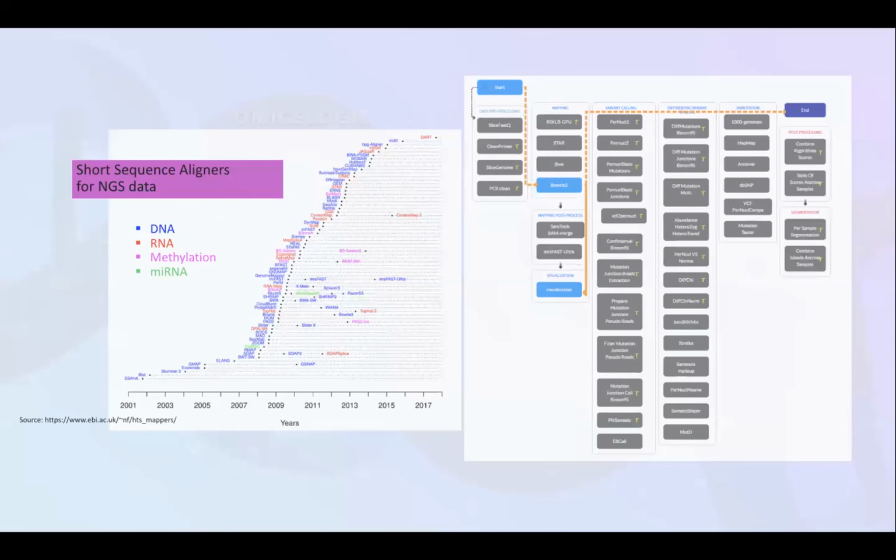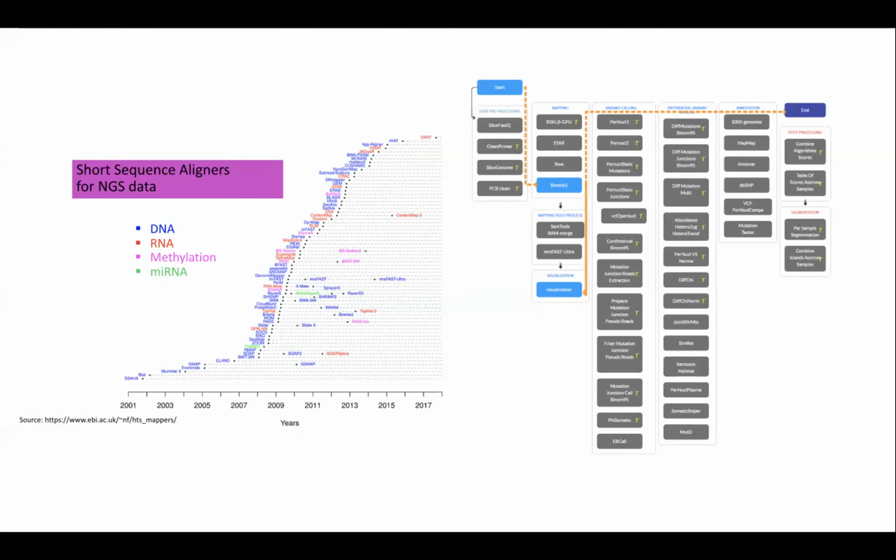So, for example, some of the things that we think are important here is the ability to really understand the various next-generation sequencing techniques that allow us to study a variety of biological, molecular biology phenomena. Like, for example, we can look at variants in DNA, we can look at expression of RNA, we can look at DNA methylation, we can look at microRNA signaling, and other aspects of what's happening at the subcellular level. But understanding what type of data and finding the appropriate methods is critical for us to be able to analyze that and get meaningful insights from the data.